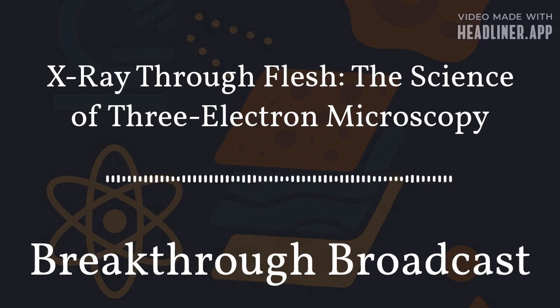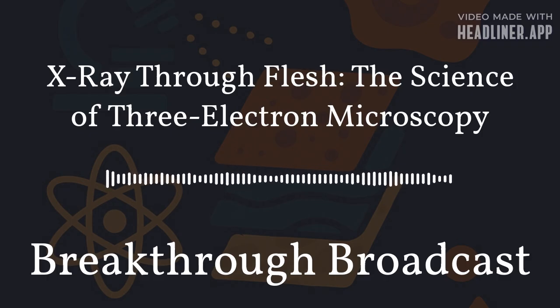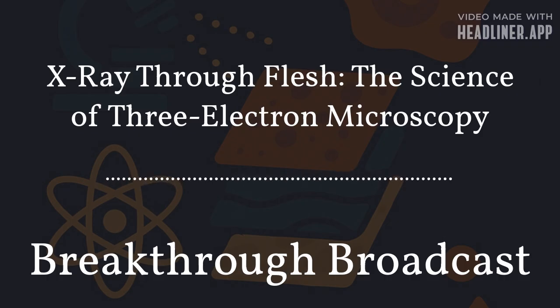Traditional transmission electron microscopy requires slicing a specimen into extremely thin sections, often under 100 nanometers thick, way smaller than a human hair. That process is delicate, technically demanding, and risks altering or losing important structures. Scanning electron microscopy, by contrast, excels at surface imaging, but cannot directly reveal the internal organization of thick samples.